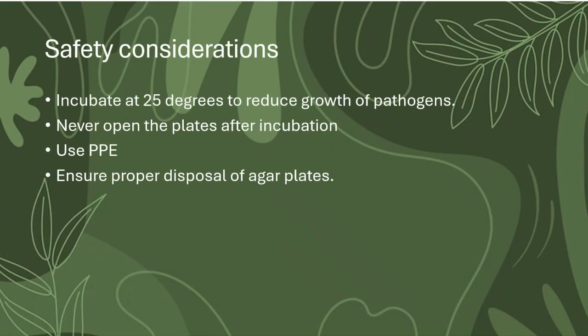So what are the different safety considerations that you need to ensure during this practical? Incubate at 25 degrees to reduce the growth of pathogens. Never open the plates after incubation, and this is something you need to remember. Use PPE during the entire practical and ensure proper disposal of agar plates. And again, the guidance on disposal is likely to be given by your lab support.